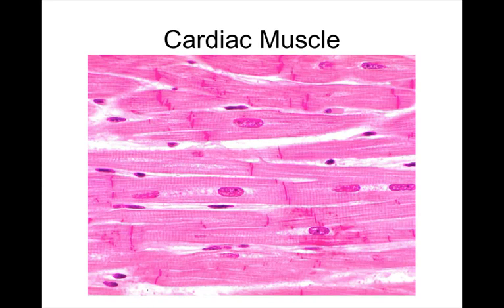Yeah, so usually the intercalated discs look like darker striations, and you're correct in that they mark the borders from one cell to another, and that's where there are gap junctions to send along the contractile impulse. We'll talk about how the heart works in the spring.